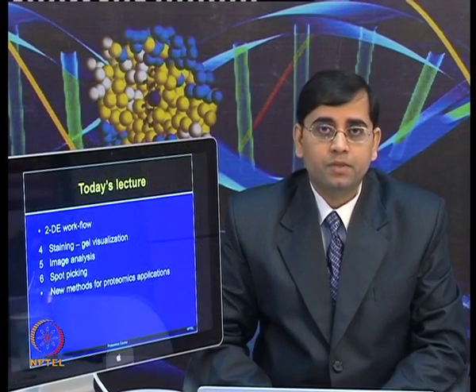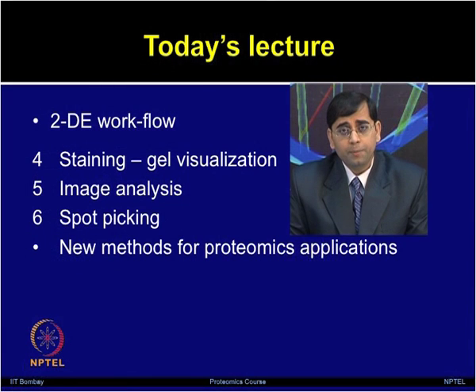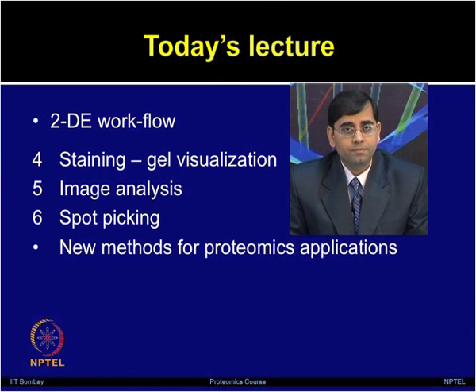I will describe some more sensitive stains and stains used for different applications such as SYPRO Ruby, Pro-Q Diamond, and Cyanine dyes. Each one of these is used for various unique applications. For example, the Cyanine dyes are used in one of the advanced forms of gel electrophoresis, which is known as difference gel electrophoresis. In this method, you mix the Cy dyes together and separate the proteins on one gel itself.